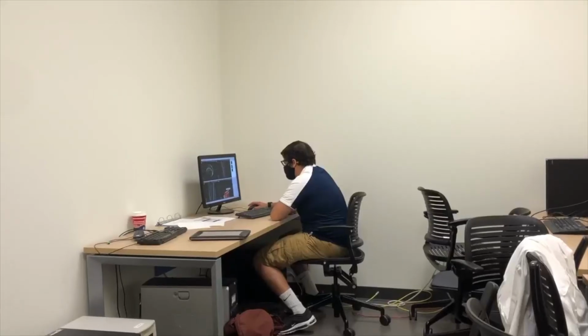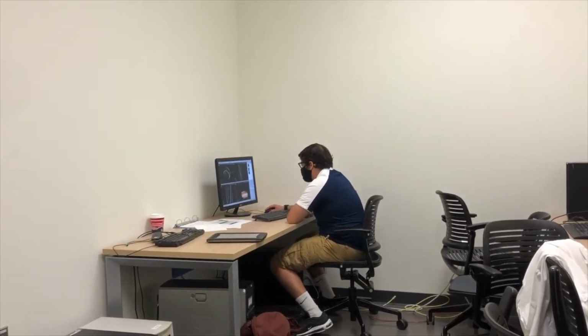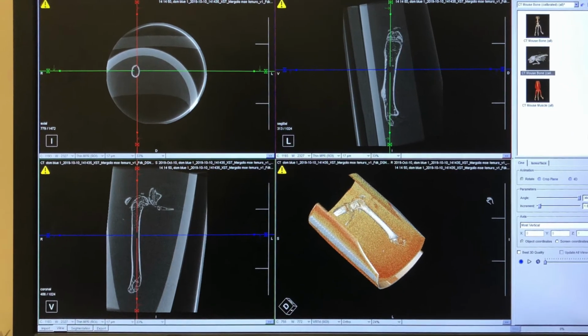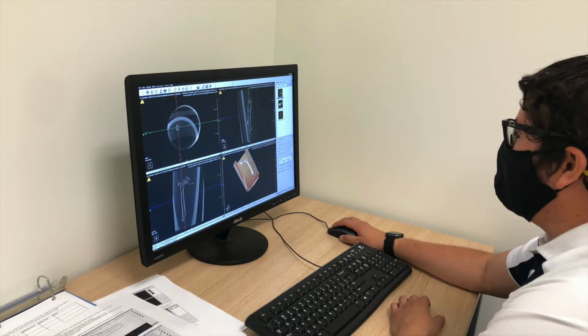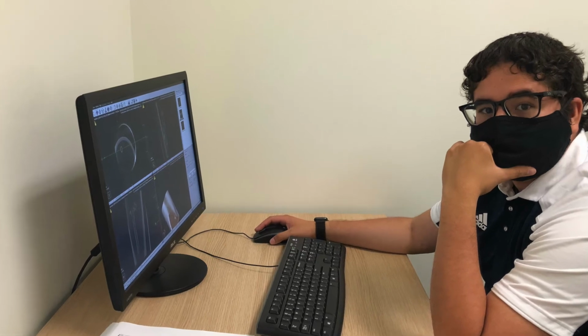This is where my work comes in. This summer, I'm using CT scanning analysis software to measure the volume of the leftover scaffold and bone. I am conducting these measurements from CT scans taken from animal models that had implanted scaffolds to test if PLA is a more valuable material for scaffolds to be made out of than PBT.